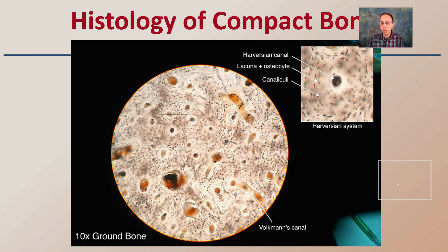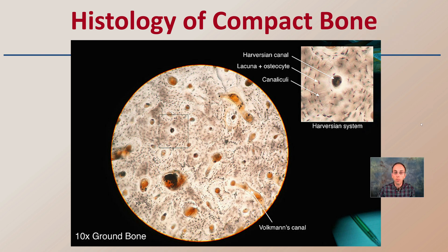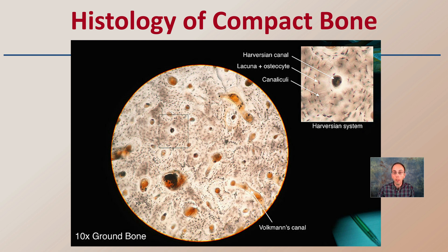Looking at the histology — the microscopic view of compact bone — at 10x of ground bone, we can see what it looks like and what we're focusing on. The Haversian canal is what we're going to be looking at here. Looking at the Haversian system, we can really focus in on that, and this is the area within a field of view that we're going to examine.